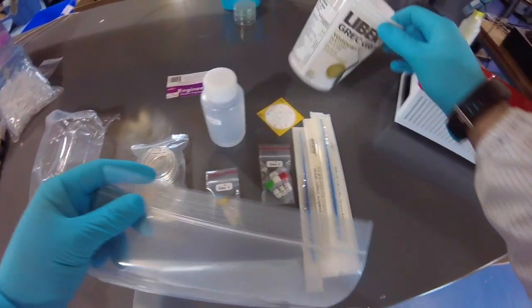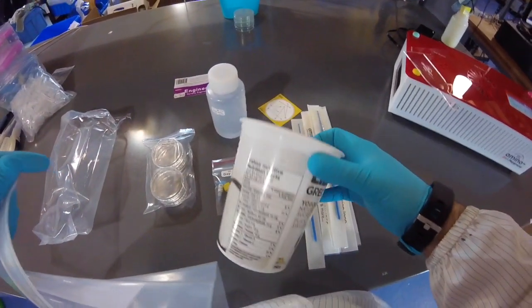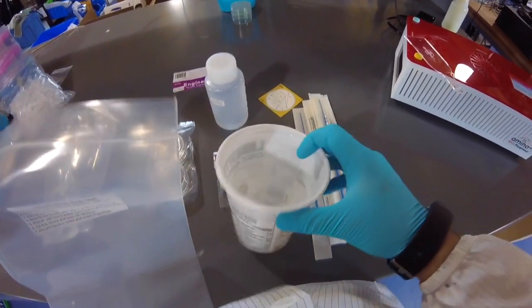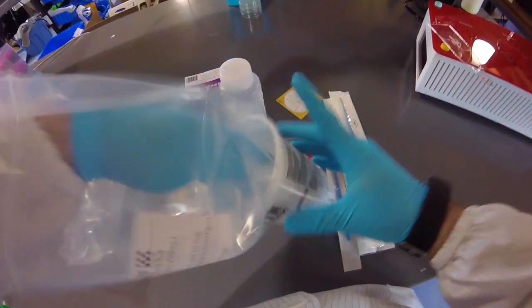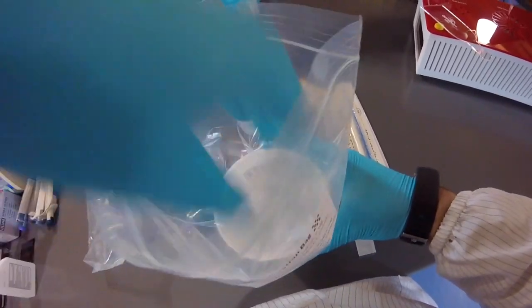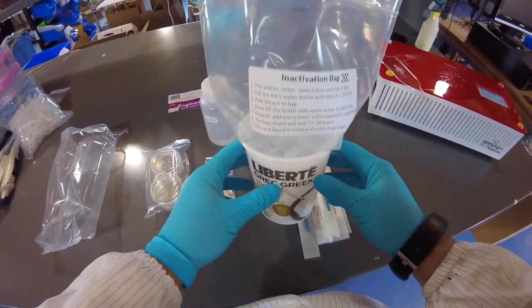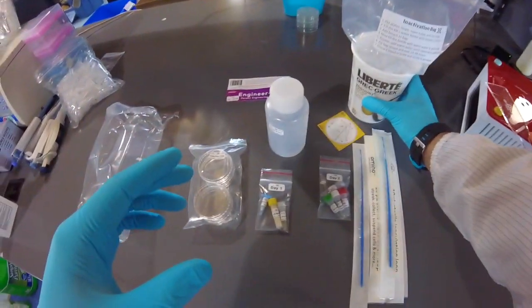And so I have a yogurt container here. Just a normal yogurt container. If you have something even a little bit bigger or heavier duty, you can use that as well, but this is a very cost-effective way to prop up the bag. You just put the bag into the yogurt container, and it'll just sit there, okay? And so you can put your stuff in there as we go through the experiments.